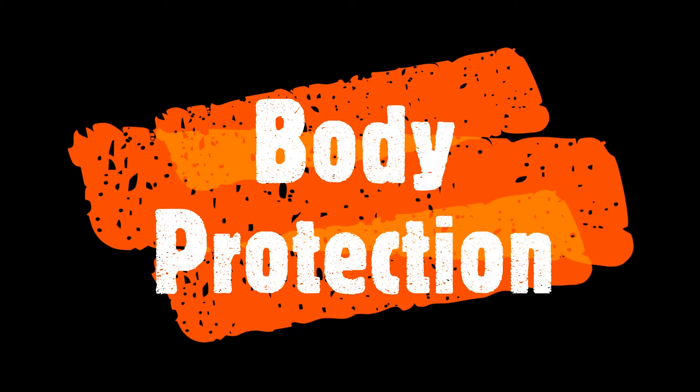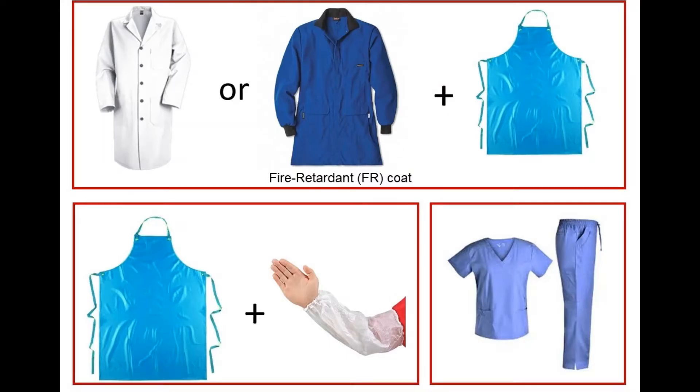Now let's talk about body protection. Body protection can take many different forms. This can include a regular lab coat or a fire retardant lab coat required for working with pyrophoric materials. Some procedures may also require a splash apron to be worn over a laboratory coat, such as when using liquid nitrogen or for particularly messy procedures. It is also acceptable to wear an apron and disposable sleeves or scrubs depending on the type of work you do. It is important to remember that your torso should be fully covered from your shoulders to your wrists.